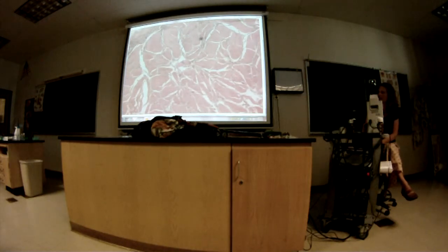What's the name of this layer? Detrusor muscle, yeah. I don't see it on your list, but for purposes of lecture, what kind of muscle tissue is that? Smooth. It's gotta be smooth, right? It's pretty rare that we have skeletal anywhere other than skeletal muscles, a few places here and there, like entrances and exits to the tracts, and a couple of random ones like the diaphragm.